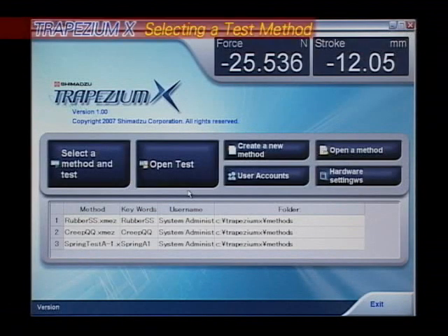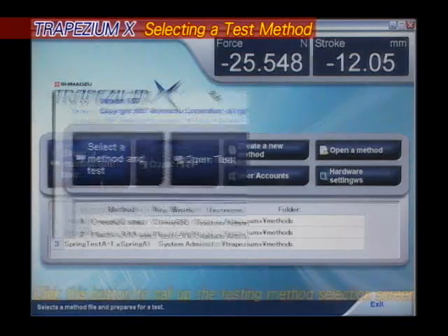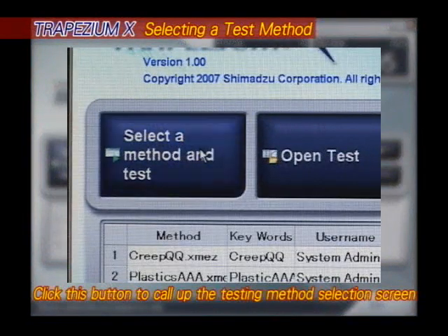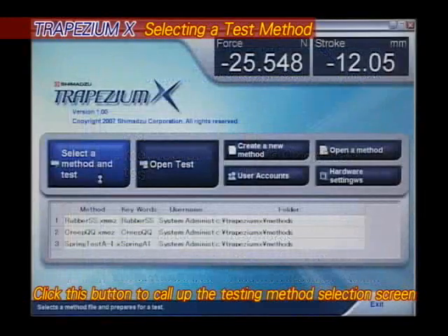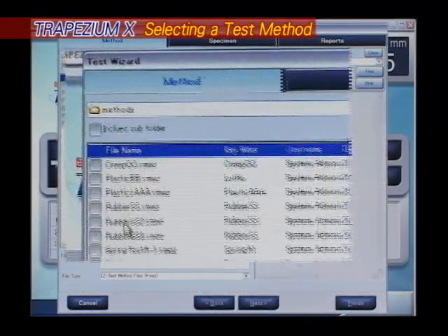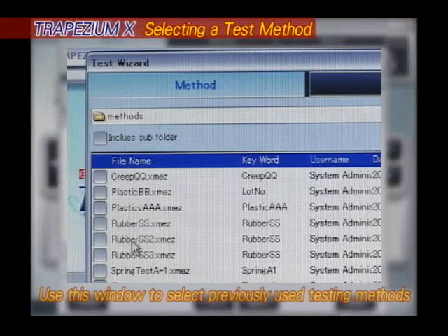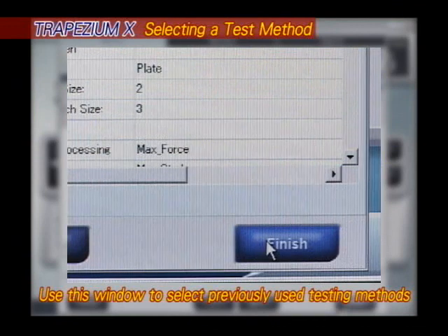To perform a test, first select the test parameters. In this case, parameters have been saved from a previous test, so there is no need to specify the same parameters again. This allows you to perform the actual test right away.